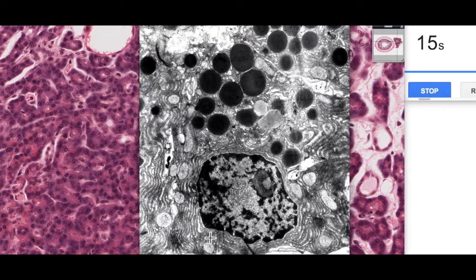you can see that the base of the cell we've got all of this rough endoplasmic reticulum and therefore that's accounting for the basophilic staining, so the staining with hematoxylin. The top of the cell has the secretory granules with the protein, the enzymes that's being produced.